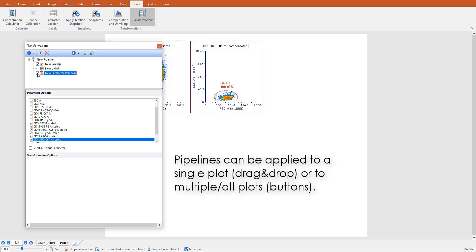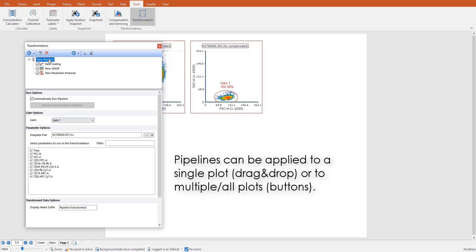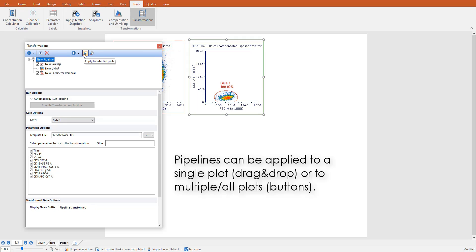Once the pipeline is defined, it can be applied by drag-and-drop on a single plot, or can also be applied on the selected plots, or on all the plots within the layout.